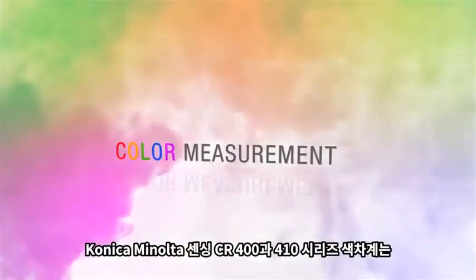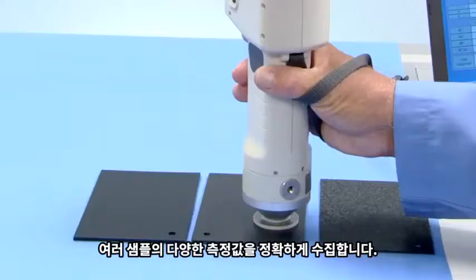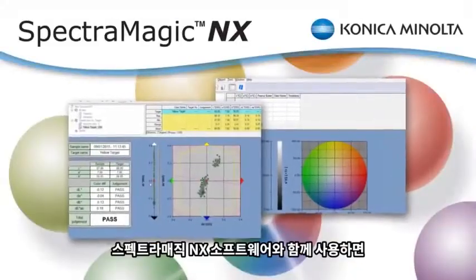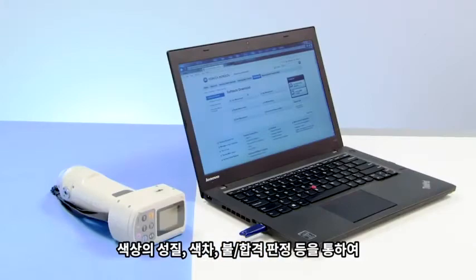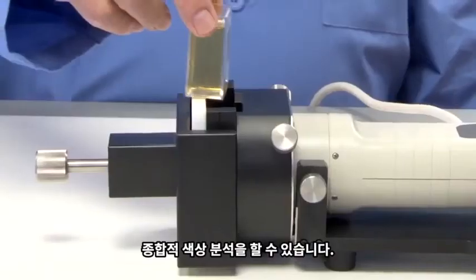Konica Minolta Sensing's CR400 and 410 series chromometers accurately capture absolute and difference measurements for a variety of samples. Combined with SpectraMagic NX software, you can identify color characteristics, determine color difference, and provide pass-fail assessments for comprehensive color analysis.